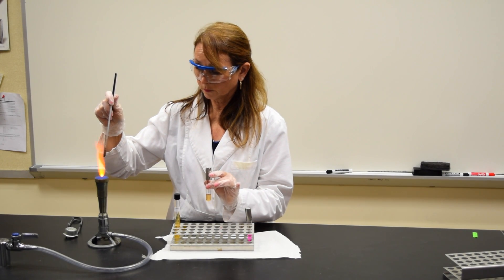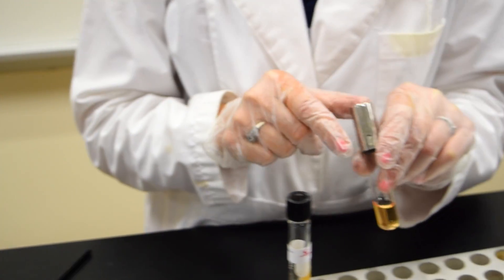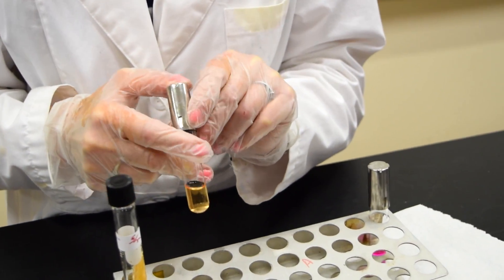Heat the loop. This tube then goes into the incubator until the next class period.